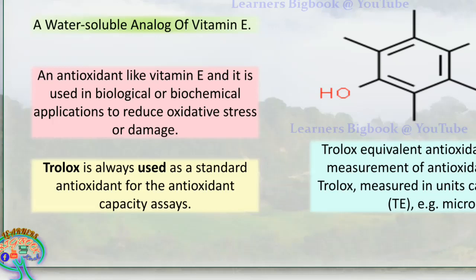Now here in ORAC, majorly I have seen experiments which were discussing both vitamin E, that is Trolox, and vitamin C, which is ascorbic acid, used as the standard reference to understand the amount of the antioxidant present in the samples which they are using to conduct the experiment.